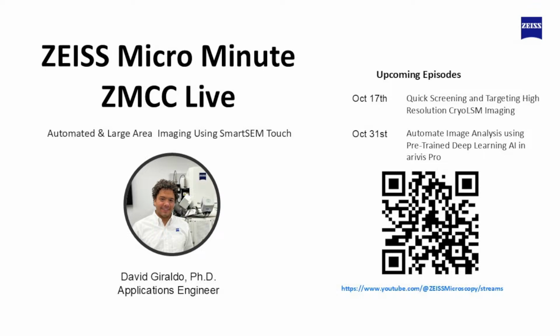Let me start with this. As I mentioned before, I am an applications engineer based in ZEISS Microscopy Customer Center in Dublin, California. And today I will be discussing automated imaging and large area imaging using SmartSEM Touch.